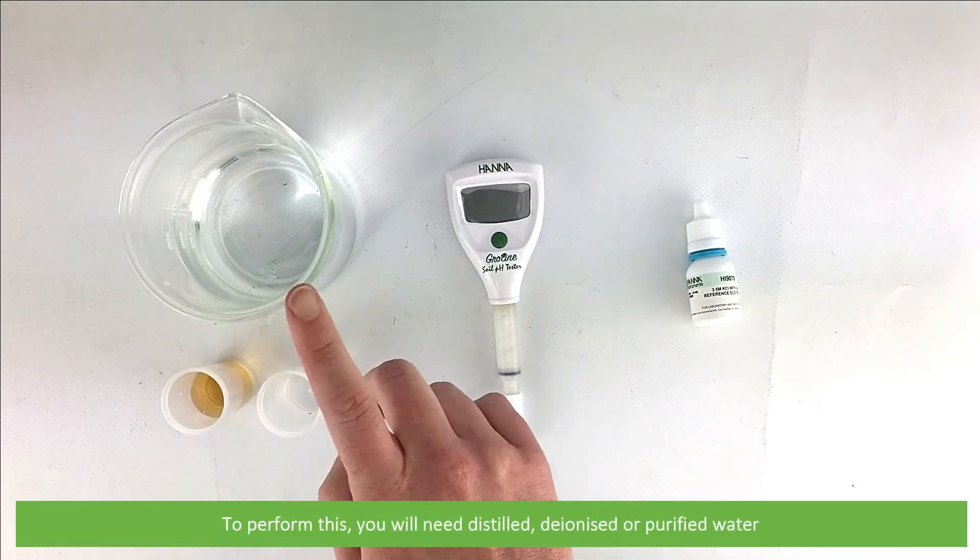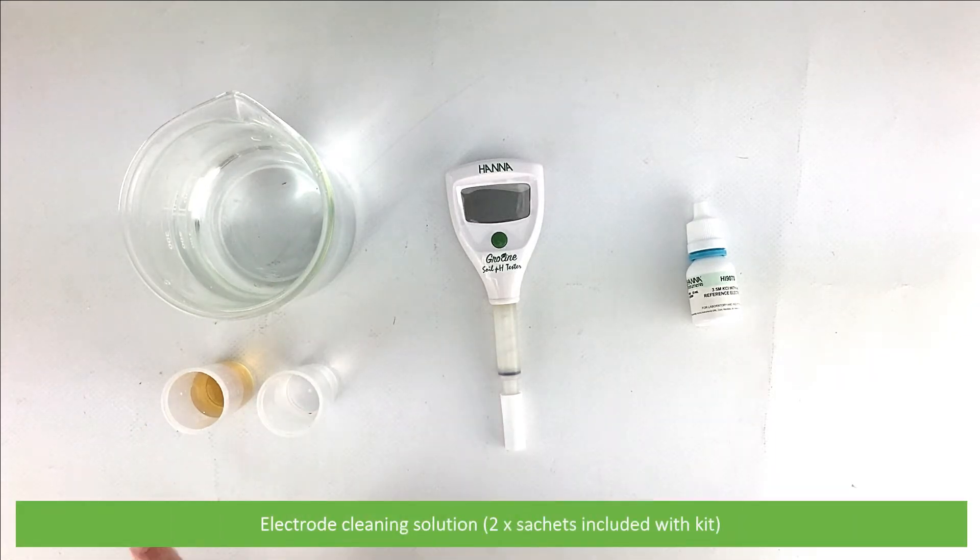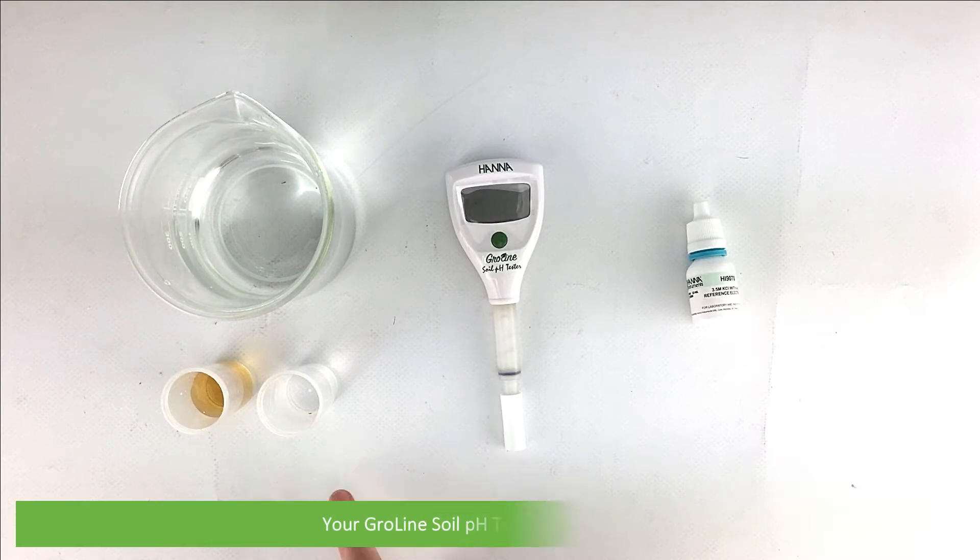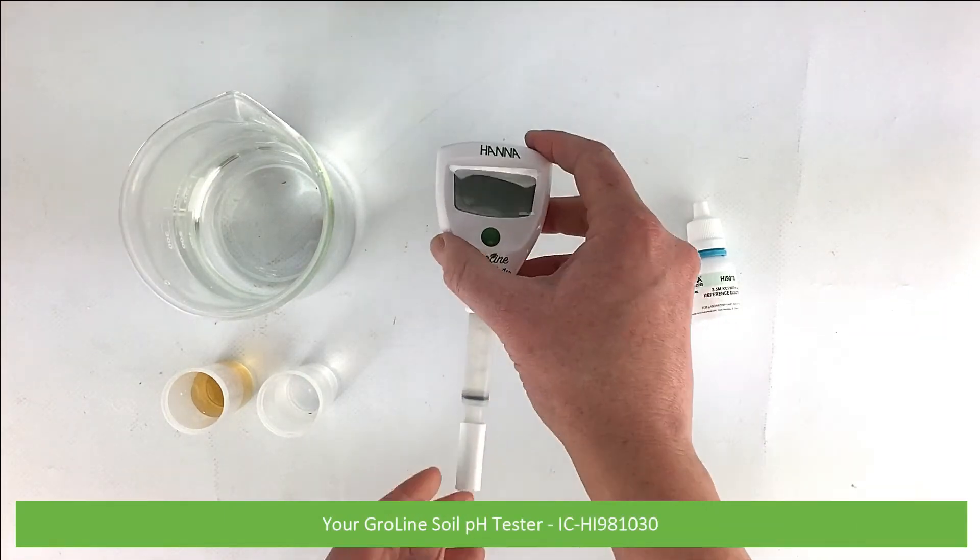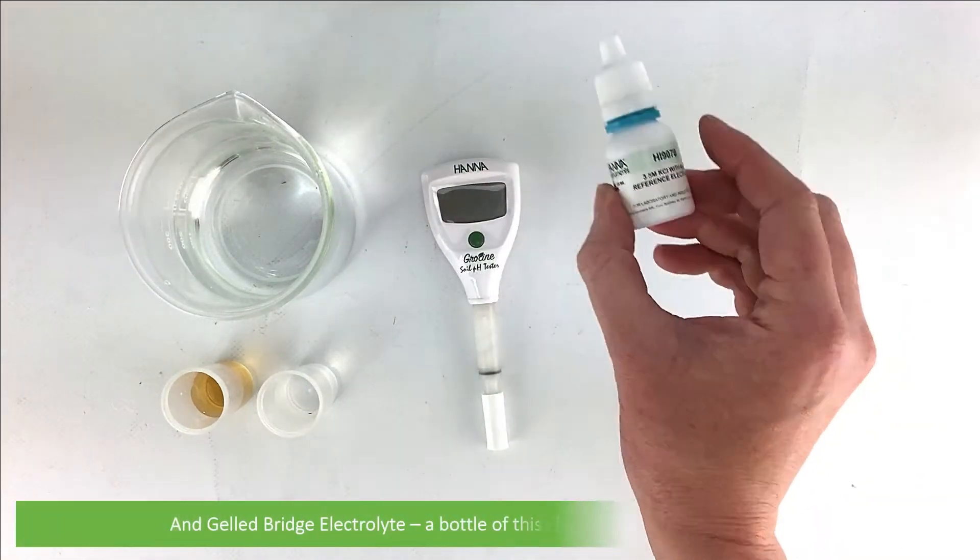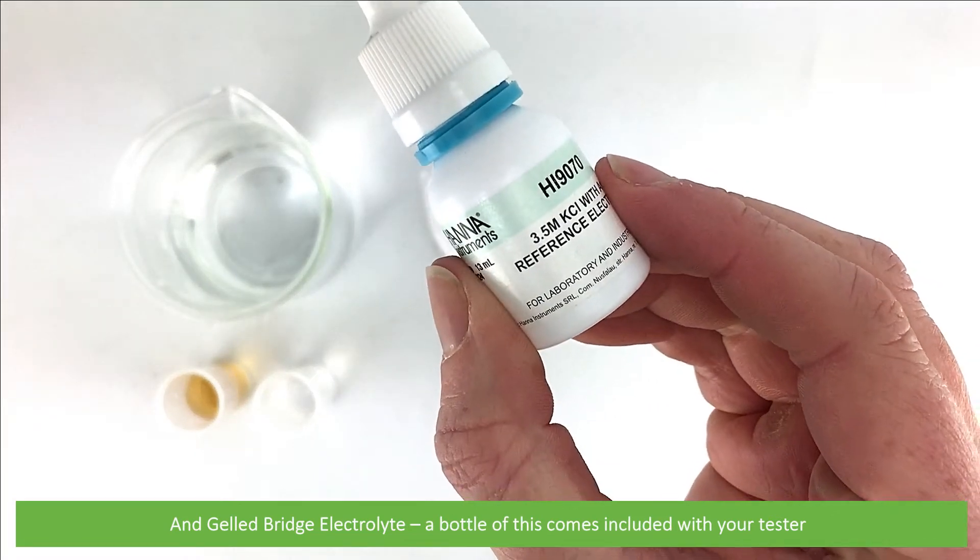To perform this you will need distilled or deionized water, electrode cleaning solution, electrode storage solution, your GroLine Soil pH tester, and gelled bridge electrolyte. A bottle of this comes included with your tester.